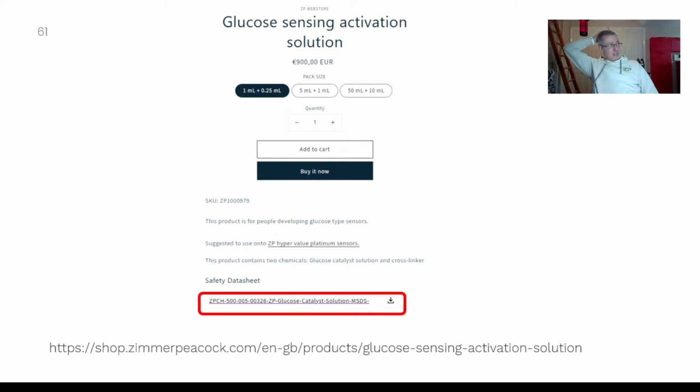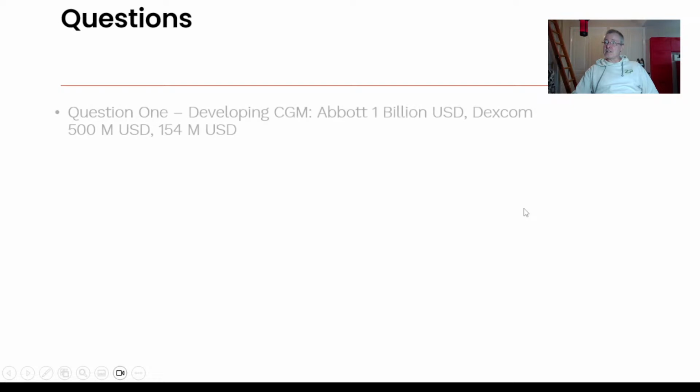So I'd hope glucose oxidase solutions for us can last a long time, but only if we keep them at minus 20 degrees C, not 5 degrees C, not room temperature, but minus 20 degrees C. Then they can last several months in the freezer like that.